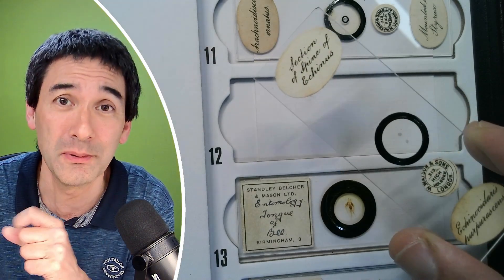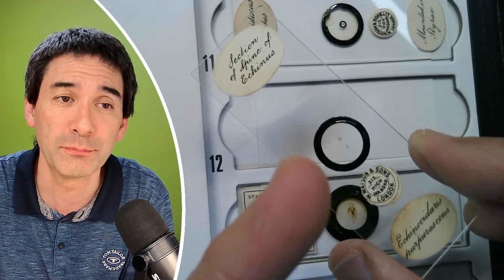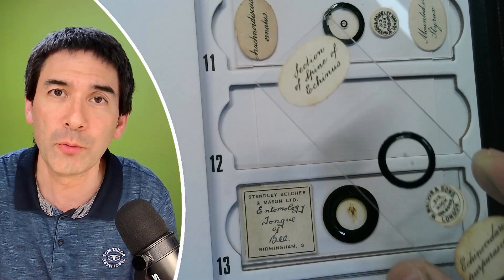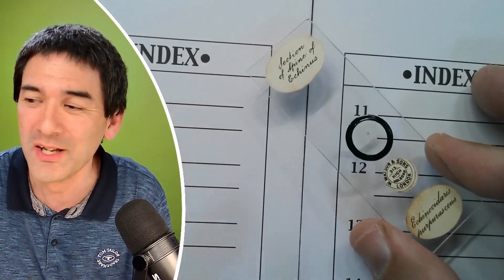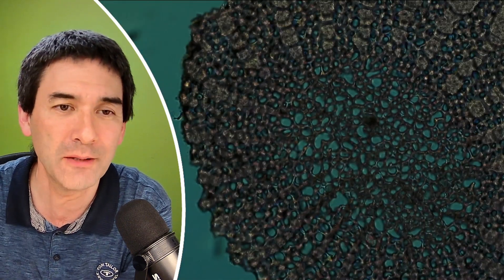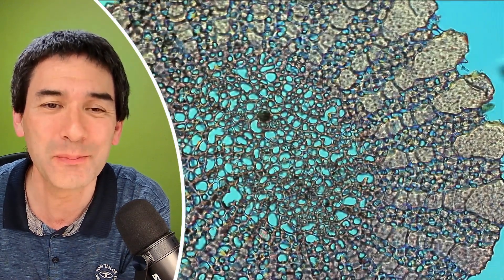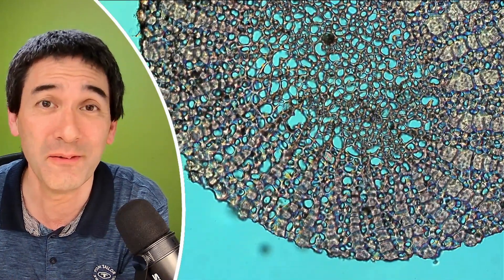It's not the spinal cord, obviously, but the spines are those spikes that sea urchins have. This is something they probably prepared also a hundred years ago because W. Watson and Sons was around at the time. The main idea is: please put the date and also the mounting medium and the preparation on the slides if you make slides. So let's have a look at this under the microscope. You can see that it looks very porous — it's made of calcium carbonate. If a slide is properly prepared and properly mounted, then the slide can last for a very, very long time.